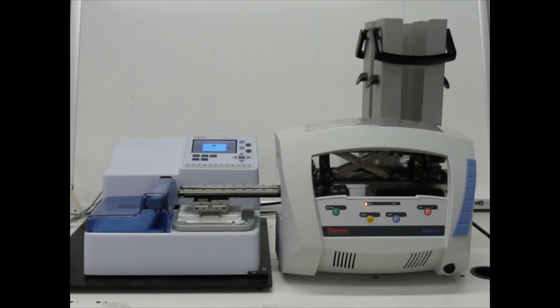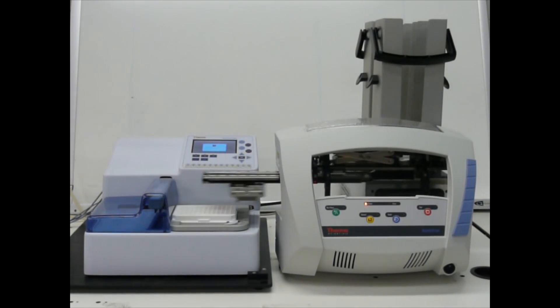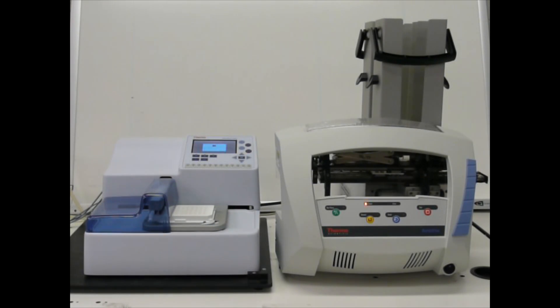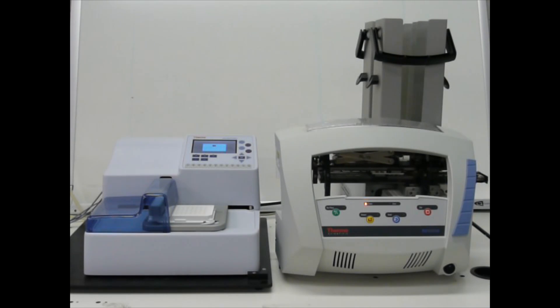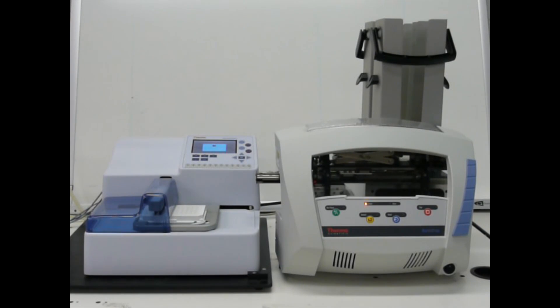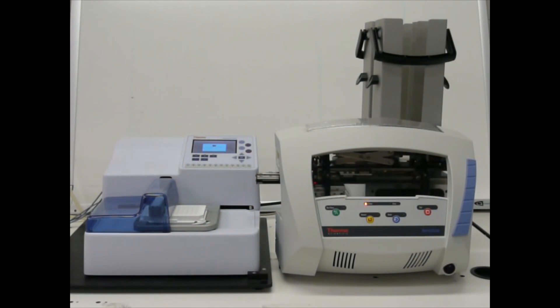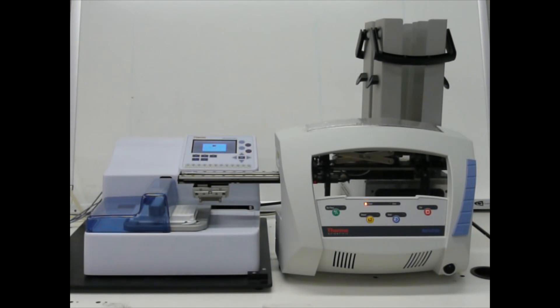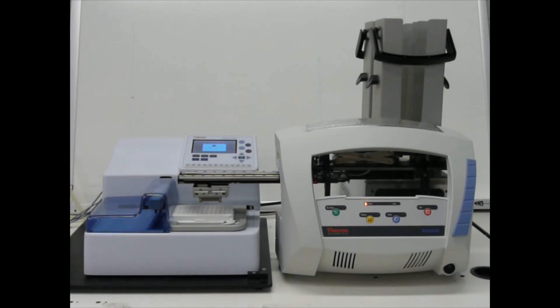Here we see the RapidStack and the WellWash Versa working perfectly together. All assay protocols are predefined in the WellWash Versa's internal firmware, including all parameters needed to wash the assay plate. Just select the predefined protocol from the WellWash Versa protocol list.